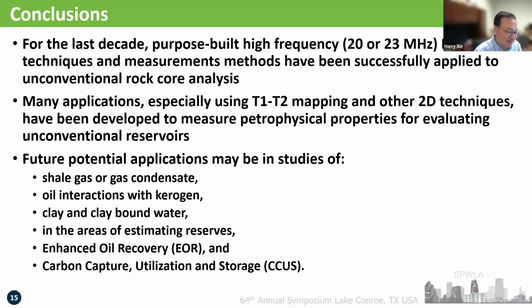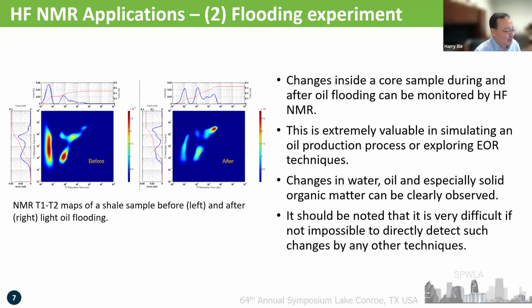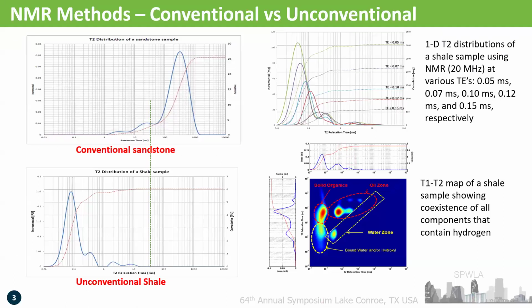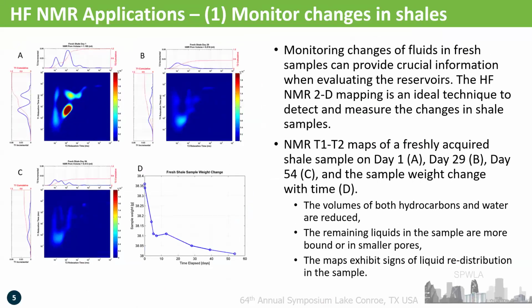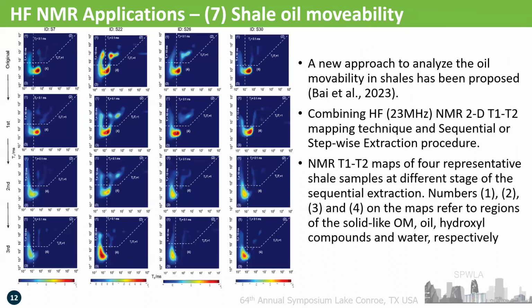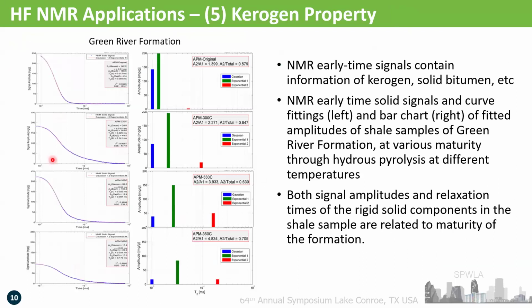I don't quite understand your question. So can you, yeah, I think there was a slide where you showed those peaks. Okay, let me go back there. Back, yeah. Here, right? Not this one. Forward. Yeah, that one. Go back. This one? One more. Go back one more. Here. Yes. Okay. So here you are fitting the Gaussian in the very early T2 times, right? Yes. Any particular reason, like did you see that's the best fit?